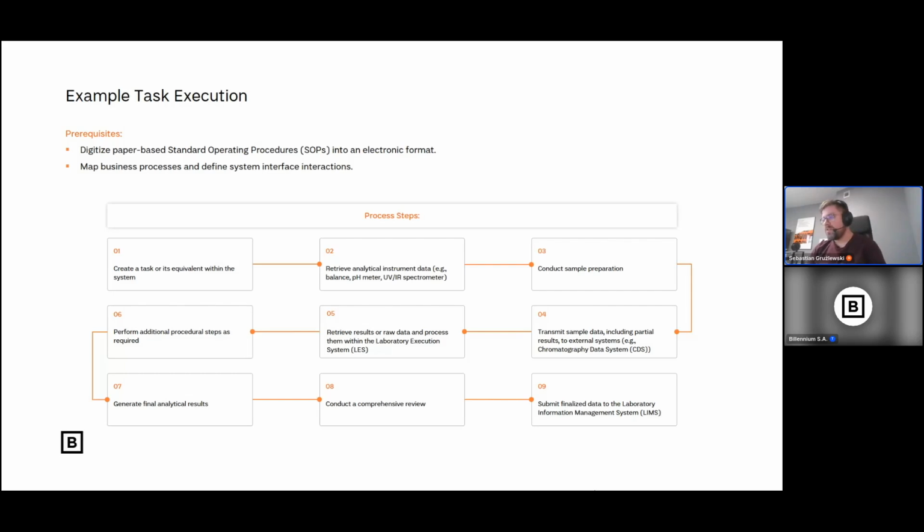So these are the questions you need to take into consideration, because all this can be done in many different ways, and it really depends on your needs, on your customer needs, and basically what works best in a system. Okay, then we need to basically do the work, conduct the sample preparation, perform some kind of laboratory tasks, and let's say this is an Empower chromatography analysis.